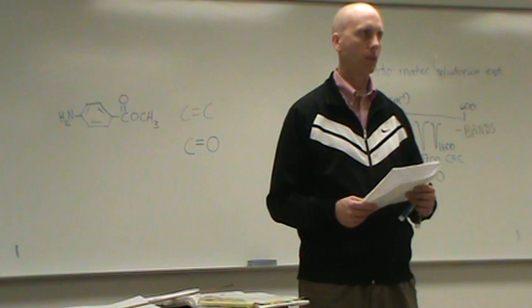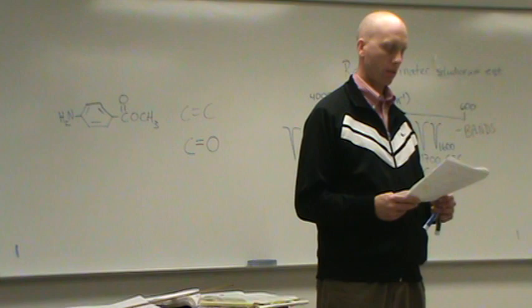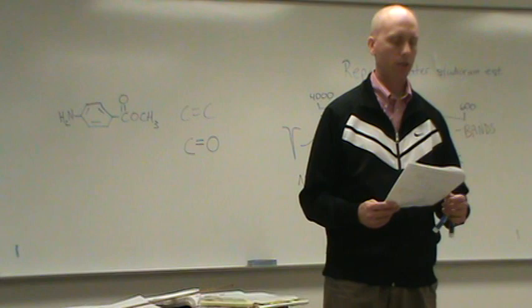What do you say about the peak in the 1600s, one of them being short and one of them being long in the benzene ring? No, same thing about that in the 1600. That was in the 3000s. In the 3000? Right. So the shorter one, the 3000s will be a benzene.